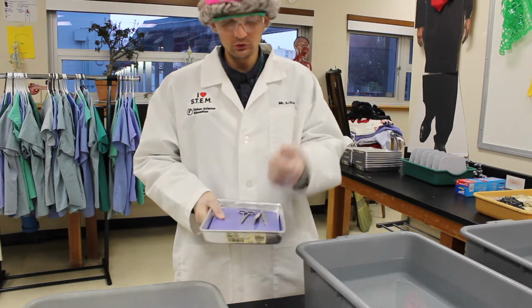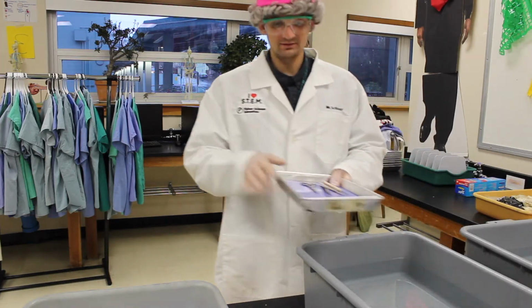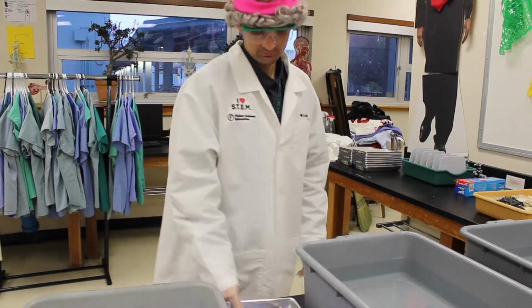So, and the tools, don't leave them sitting in here. You need to grab them, rinse them off. Everything gets bleached and everything gets rinsed. That way we keep it clean and safe for the next class. Once you finish, you're going to flip it over to dry.